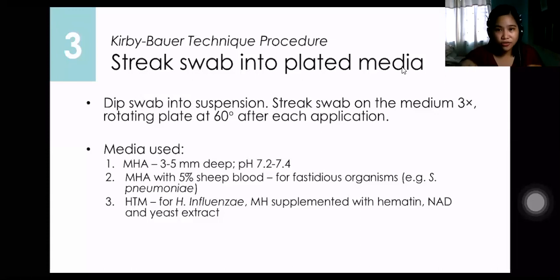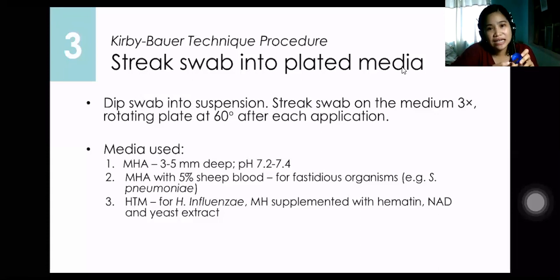When you say arado, do ginabungkal mo ang lupa. So, kung bugat ang kamot mo or kung hindi ka pa sanay, may chances nga ginaarado mo ang agar. Kung ginaarado, it means gina-disturb mo or ginapangpakit mo ang gelatin or ang aton nga MH agar.